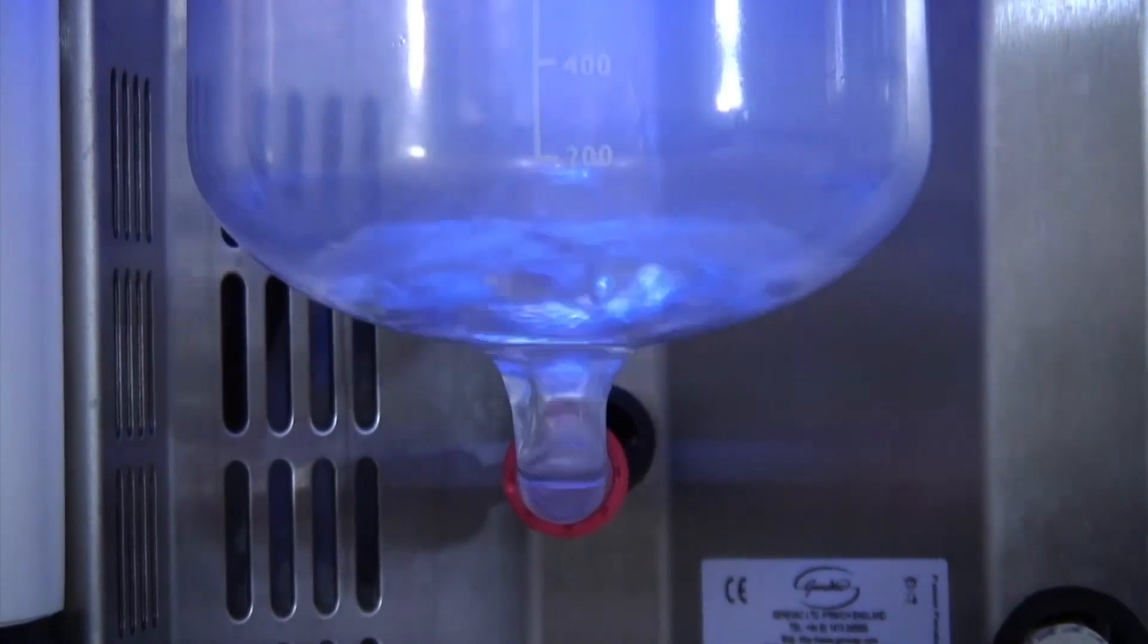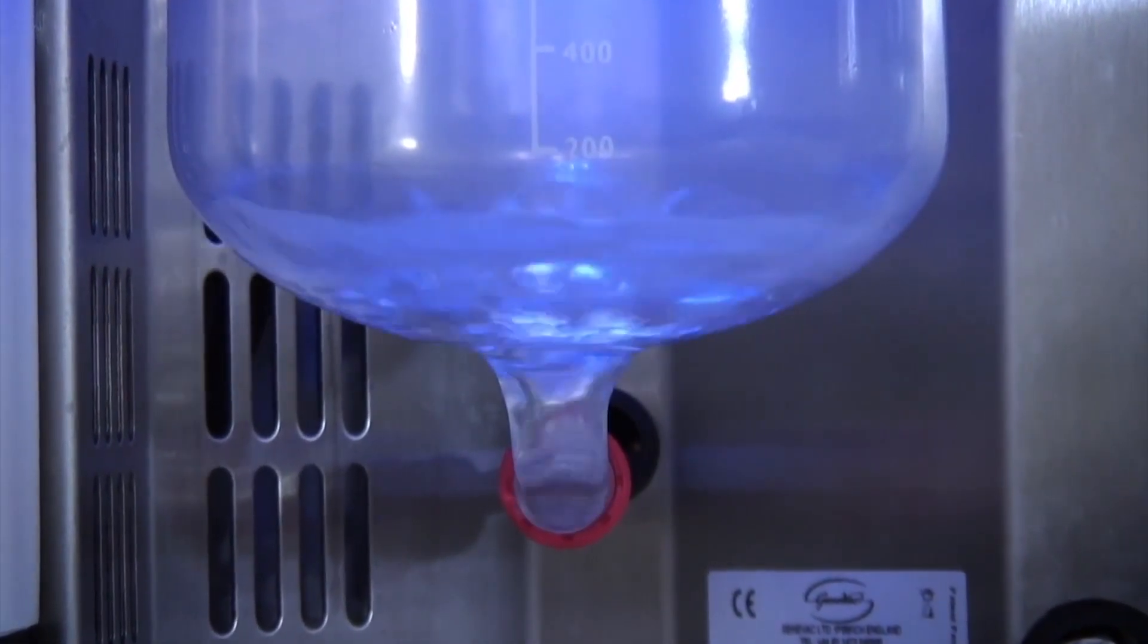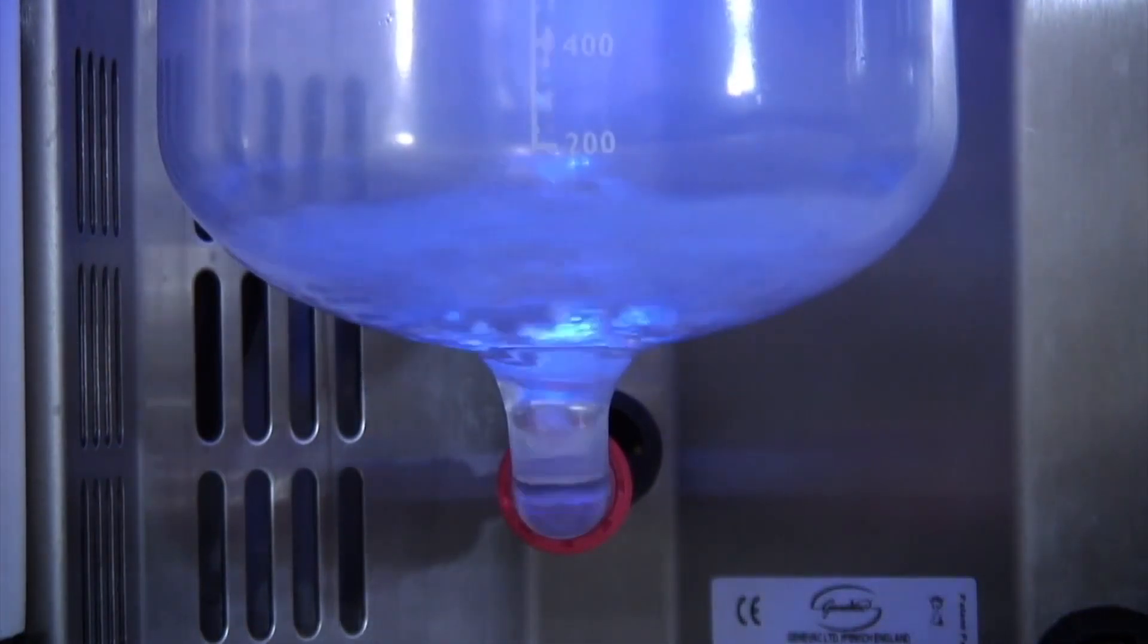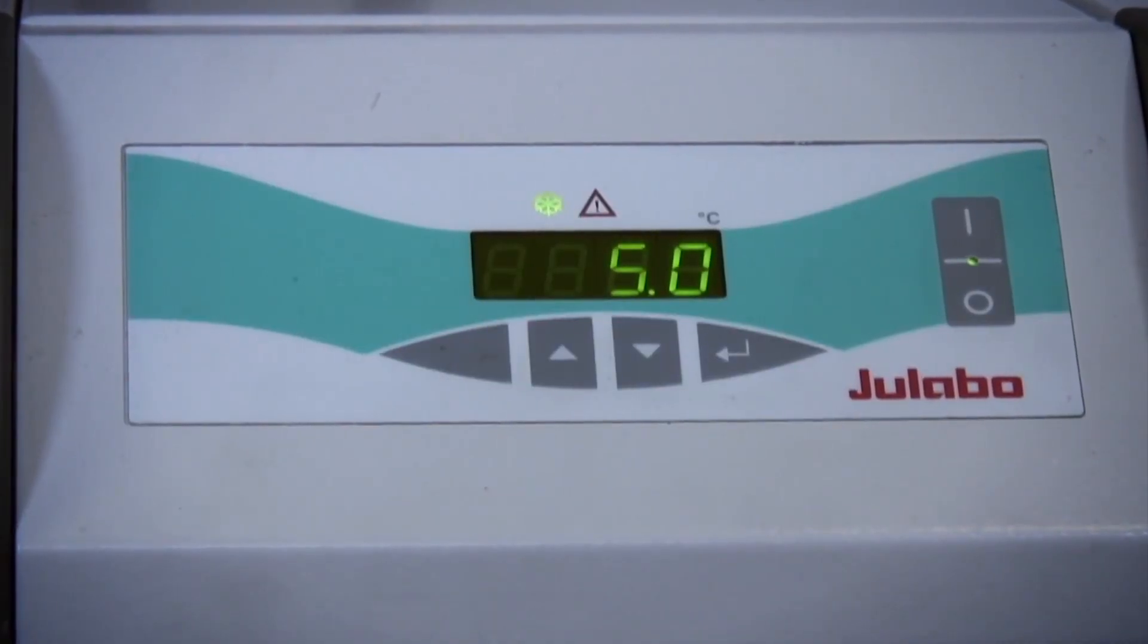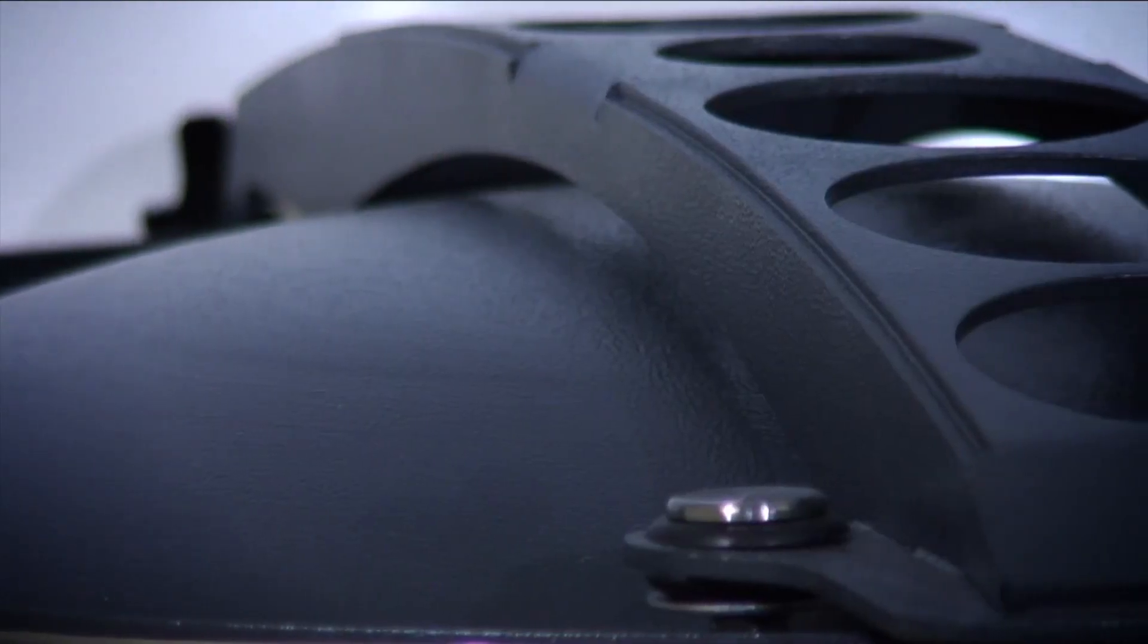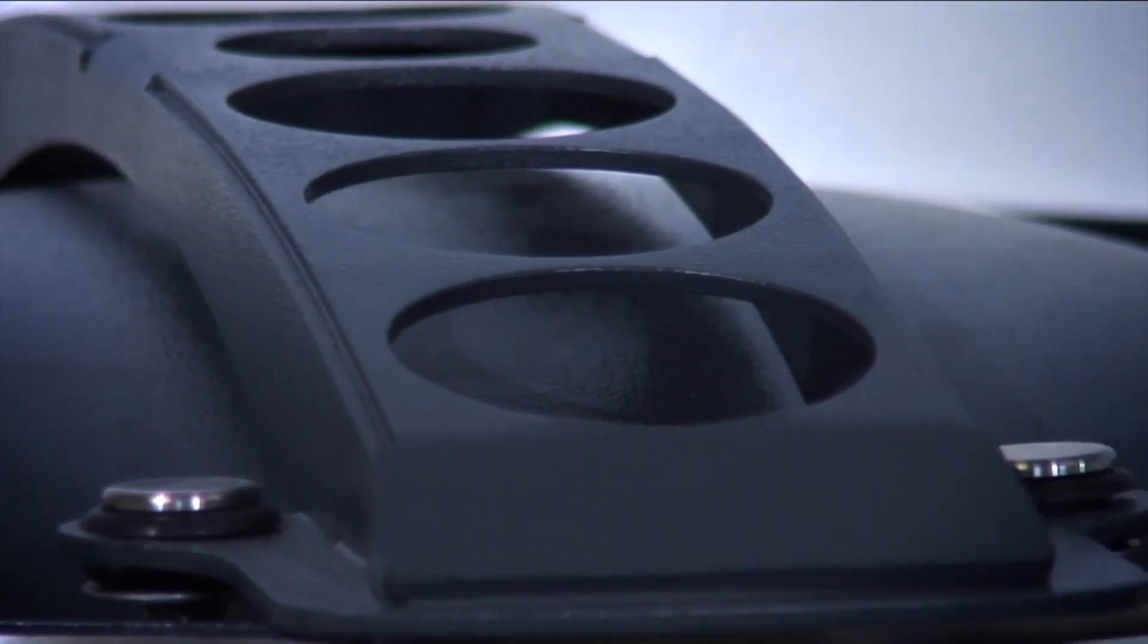The samples are spun and, as they boil, vapors are drawn to the cold trap which condenses the vapors to a liquid. A remote chiller is used to cool the cold trap. Alternatively, coolant from a ring main may be used.